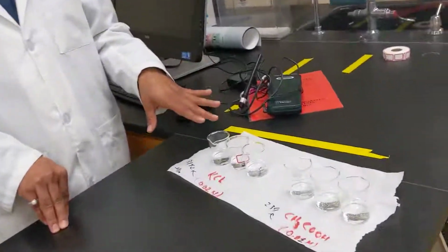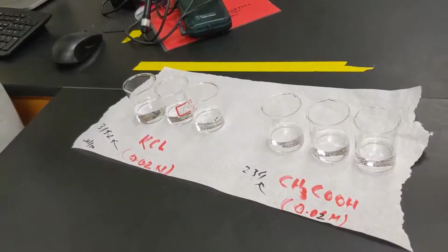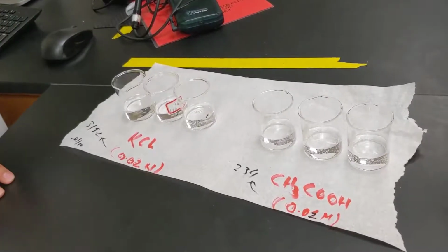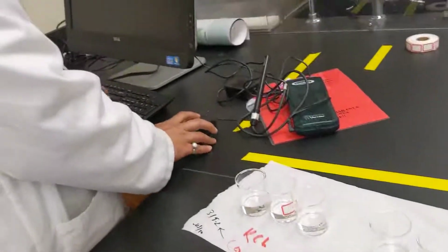And you can dilute them, I mean, first you can dilute 1 by 4, 1 by 8, or 1 by 16, right? And then you do the same dilution for the other, 1 by 4, 1 by 8, 1 by 16, all right?